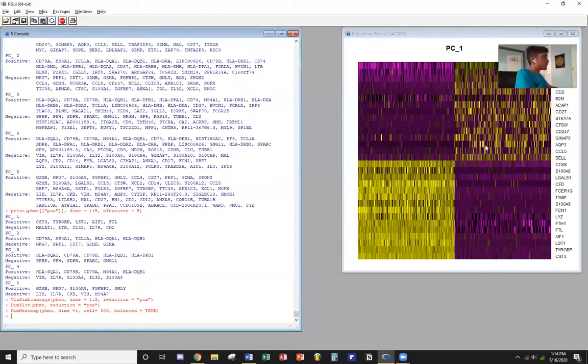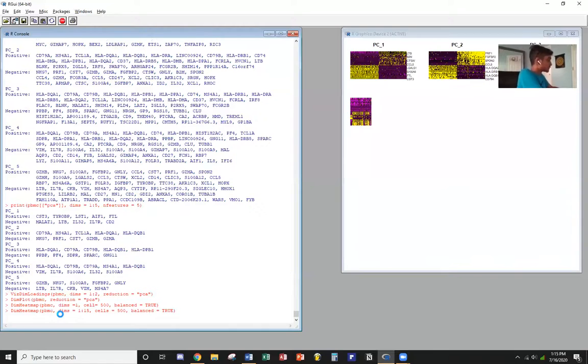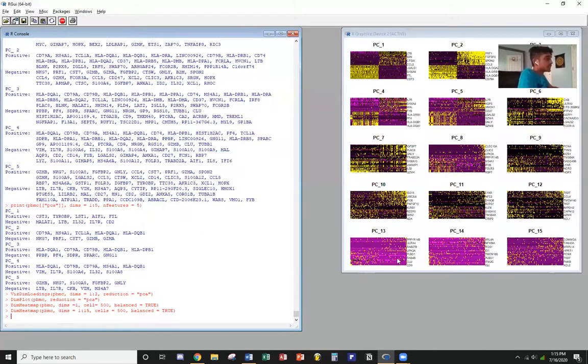This is very commonly seen when analyzing using Seurat. And then I'll give you another visualization here. It'll be a little bit different. I don't want to go too much into detail of each thing because it'll take too long, so I'm just briefly covering it. Yep, this is showing multiple different heat maps here. You can see the yellow, the pink, the dark colors. It can all help you analyze this.